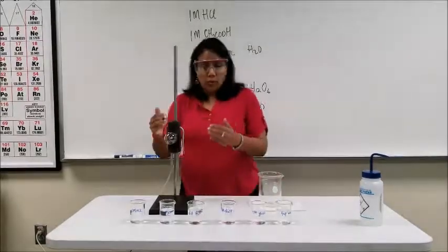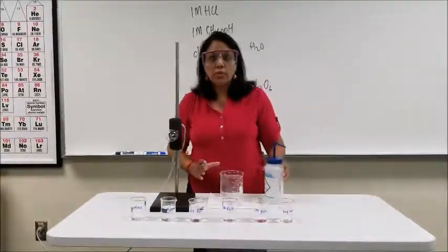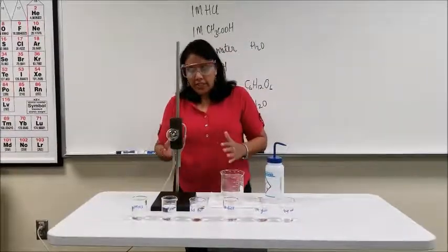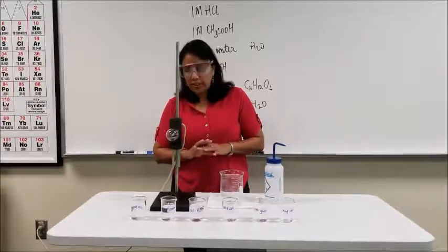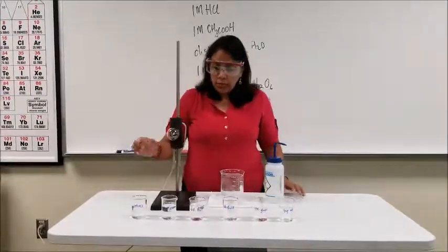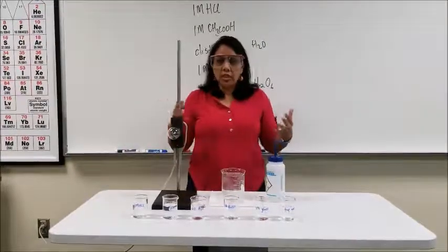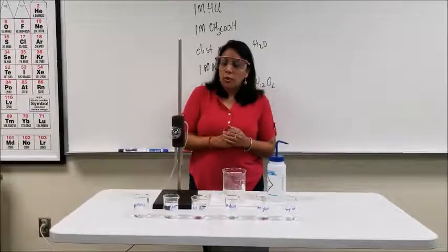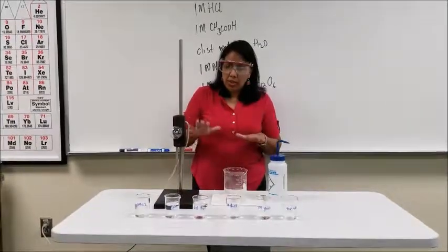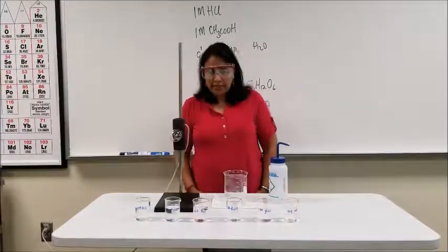Now we'll do this, and just to give you a little disclaimer, I'll be washing the electrodes in the middle, so don't wonder what I am doing here. I'm not cheating you. I actually want to keep it as simple and straightforward as possible. You will also note that I have the same concentration of everything, because if we change concentrations, we change the number of ions in there. So you want to keep it the same. It's all 1 molar, so that way there is the same number of ions.